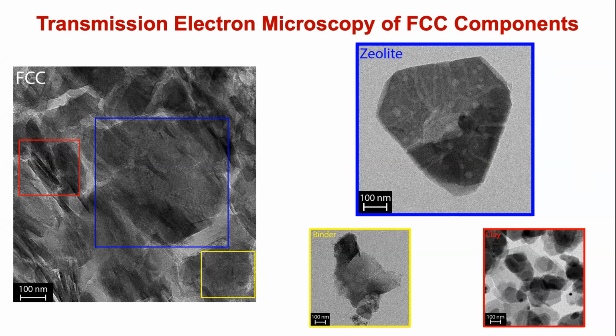Here I show you a zeolite Y image. By the way, you see 100 nanometer. Remember what Naresh showed was something of 500 micrometer. It's not that far from the reality. But for those who see well, they see actually that there are holes in this cheese. You see the zeolite crystal, and there are channels. So it means actually you damage the zeolite.